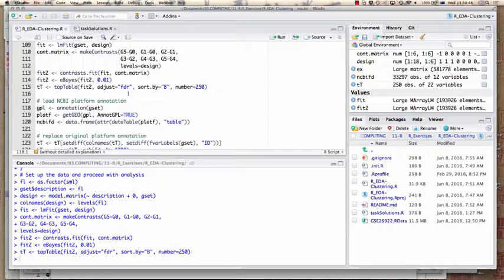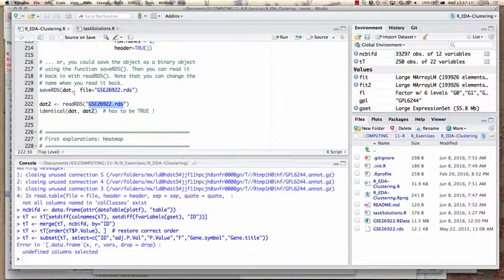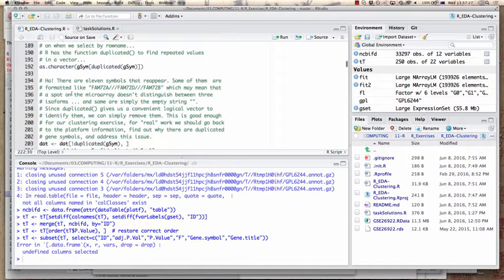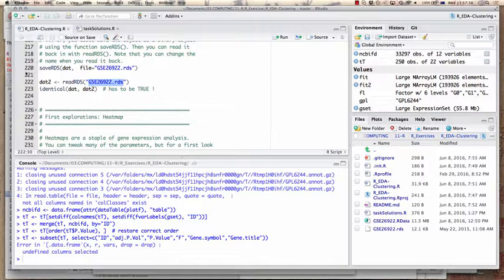The next three steps load NCBI platform annotations. The gene set contains expression values for spots on microarrays, and we still need to identify what these spots correspond to — that information is in platform annotation. Lines 118, 119, 120 download that. Apparently interaction with NCBI is tricky today, so I'll leave the script explaining how we formatted the file up to you and reconnect at around line 220 of the script where the data has been generated.